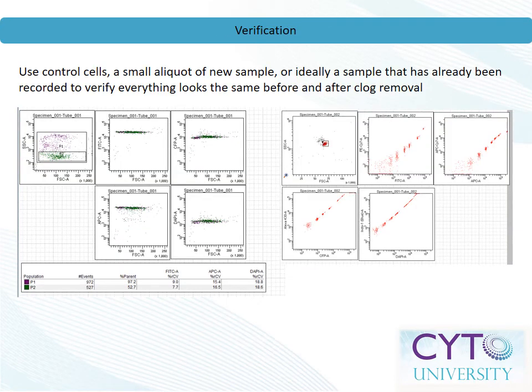As with any assay, reproducibility is key. This too is true for procedures as unglamorous as clog removal. It is important to verify that the instrument has not changed in any way as a result of your intervention. Ideally, you can rerun a sample that was successfully run before the clog occurred, but in the absence of such a sample, control cells such as glutaraldehyde-fixed chicken red blood cells, leftover compensation control samples, or even quality control beads can be used to verify the instrument's performance. In a pinch, you might elect to run an aliquot of a new sample to verify that the clog has indeed been removed and your instrument is performing as expected.